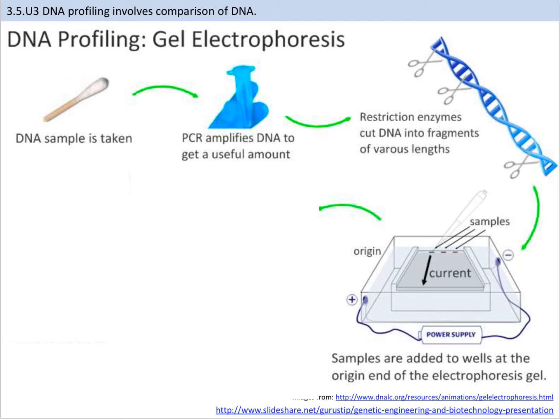electrophoresis well here. And inside this grayish area is an agarose gel, which is a pretty thick gelatin substance. It's not very easy for things to move through it because it's very dense. And then we are inside this container where everything is placed inside of an electrolyte solution, so electricity very easily passes through it. We have a negative end where the samples are going to be loaded, and then we have the positive end. And so when we run an electrical current through it, the current will move from the negative end towards the positive end.